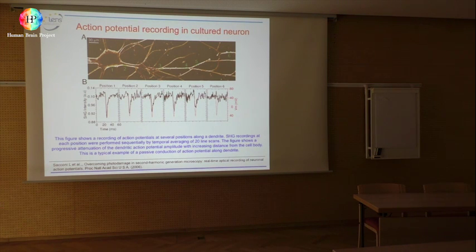And this is an enormous advantage, because if you want to visualize more neurons, you cannot use a patch clamp for each. I think that the Guinness record is 2 or 3 in vivo optical patch clamp, okay? No more. Also in vivo, can you imagine how difficult it is to make a patch clamp while the animal is moving, for example? Now you see here how nicely, this is a dendrite, the action potential is going down as you are going away from the soma, for example.